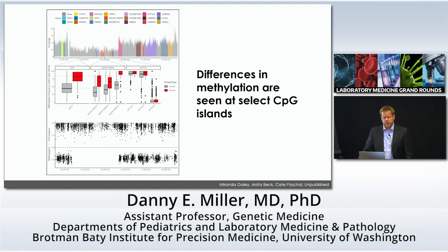So we compare these to our control database that we have. And one thing we need to do is expand our control database. But so far in the cases that we've looked at, and we've been blinded to all of them, except for a couple, we're correctly identifying the actual aberration that was known, just using either methylation by itself. And this is the exact CpG that's tested clinically as well.